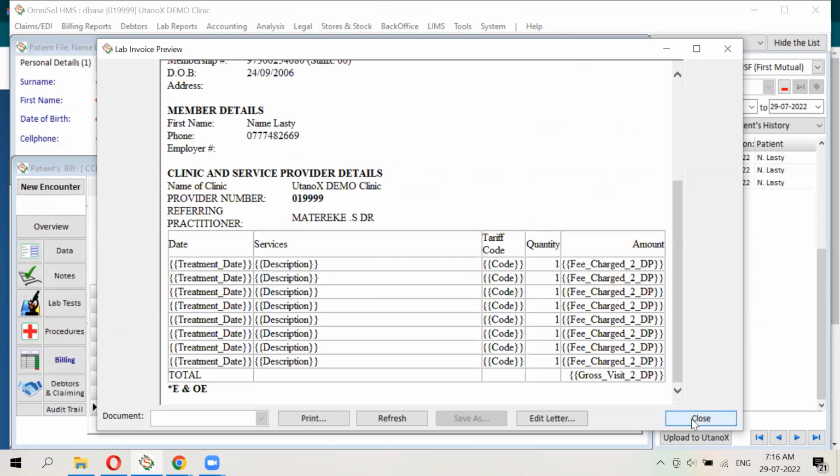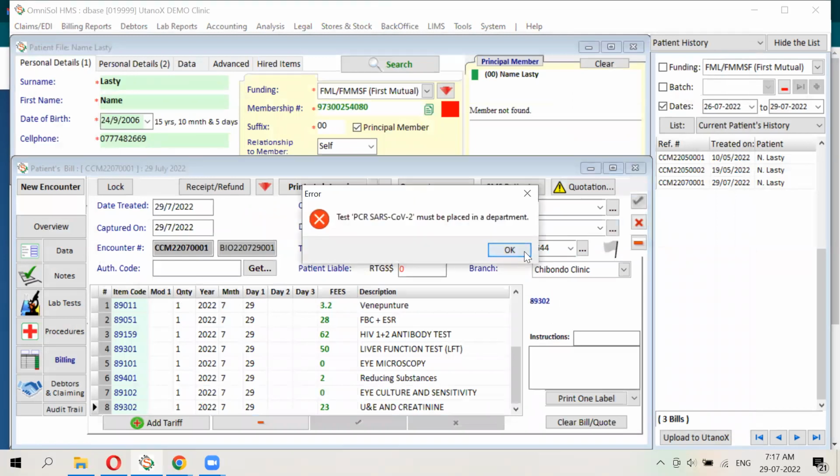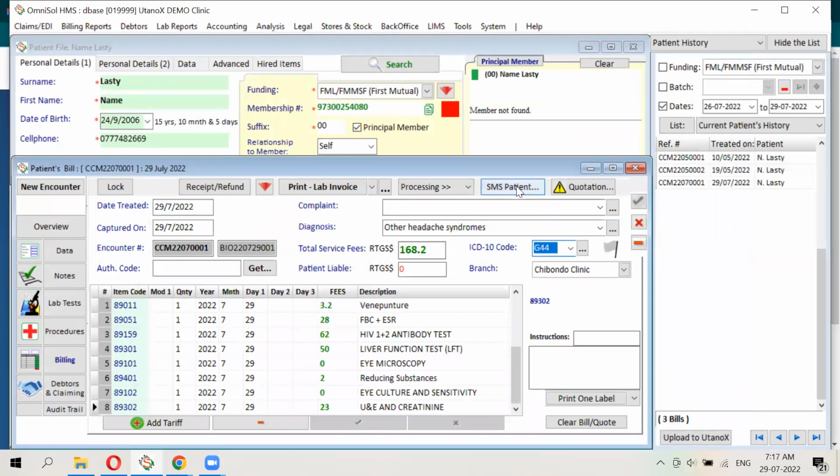Okay. Why I'm asking is because the way medical aids operate is probably different from country to country. Yes. So if we are going to see, why I asked you, please select LFTs. I want to see what happens. On our end here, when we are claiming, let's say, for UEC and creatinine or LFT, it's not claimed as a group.